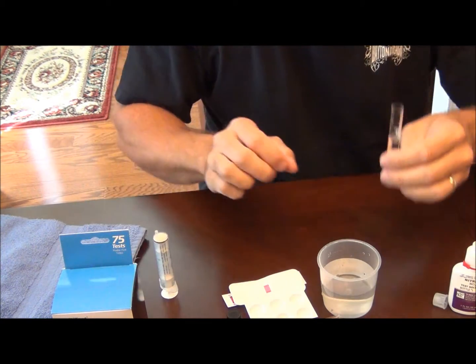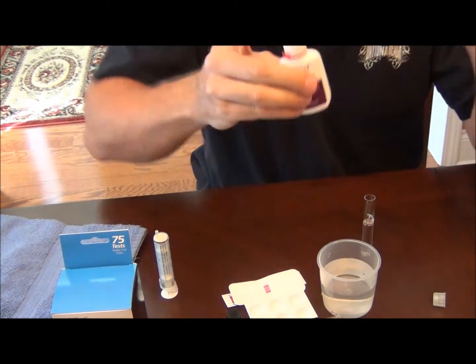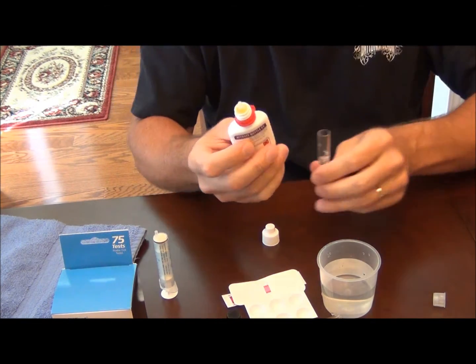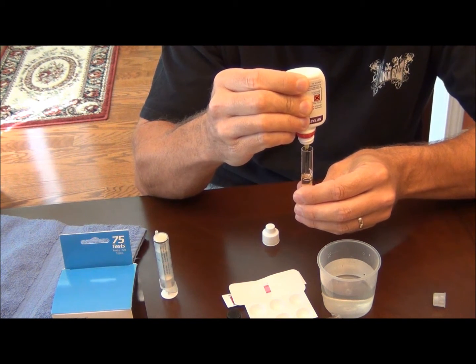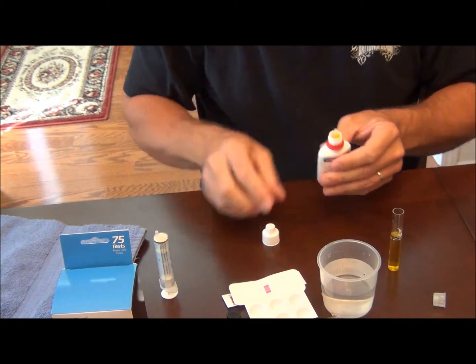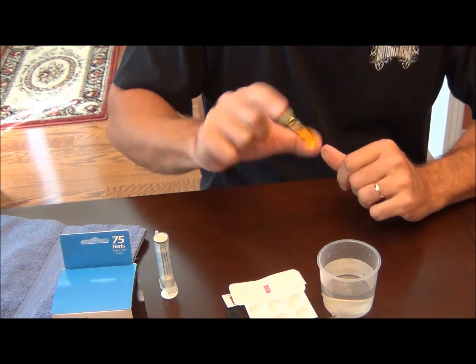I'll take bottle number one, solution number one, shake it a little bit, add 10 drops holding the dropper bottle vertical — 1, 2, 3, 4, 5, 6, 7, 8, 9, 10. Alright, cap the test tube and invert a few times.